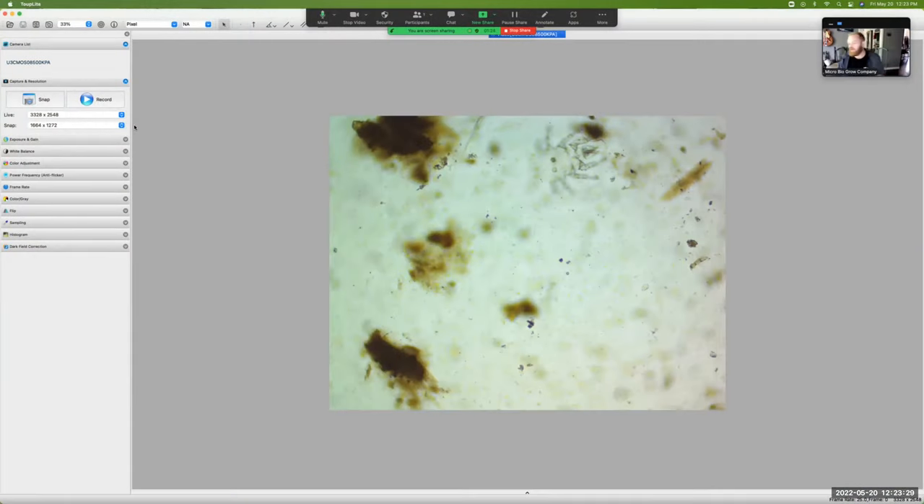What's going on guys? Jimmy with Microbio Grow coming at you again with the end of this compost pile that we've been tracking for a while now. We're just gonna take a quick look and see a couple of organisms that we have. We're not doing a full assessment right now, but we just want to see what we find and we'll go on from there.